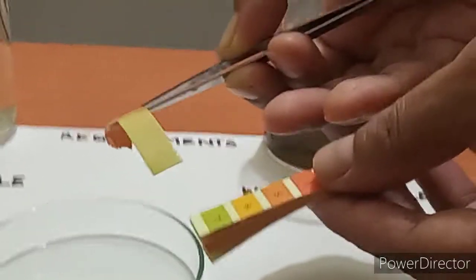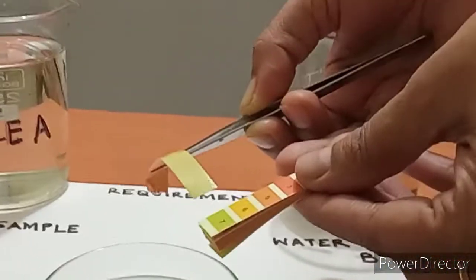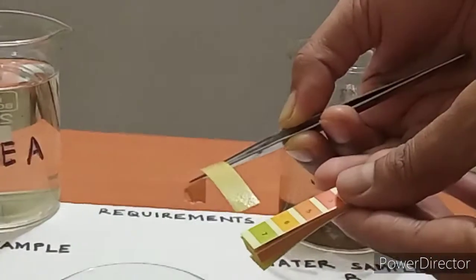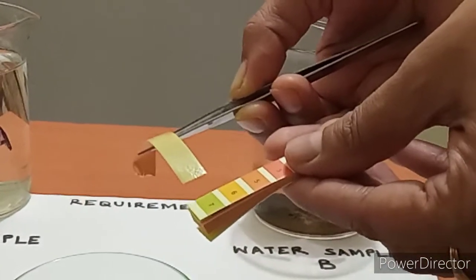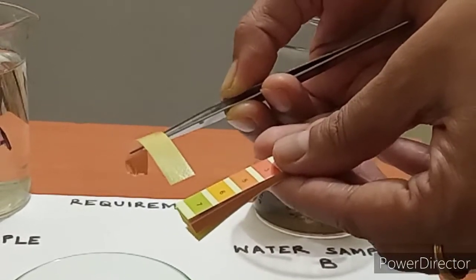Now this can also be done with narrow range pH paper, in which we can get the accurate pH of sample A.